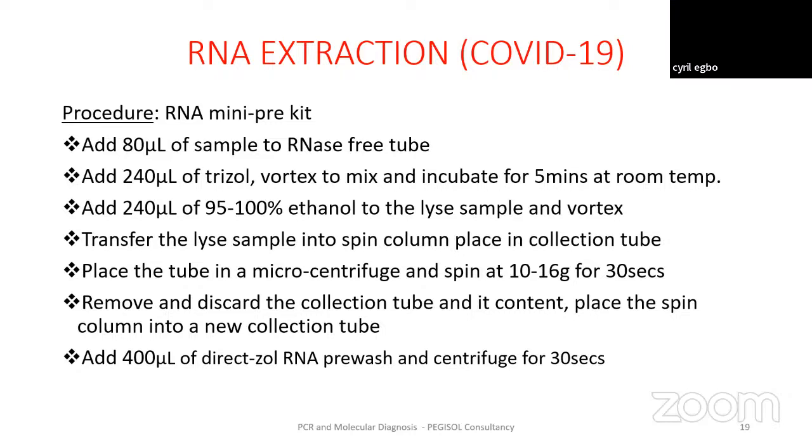Most times that is used for paternity testing. So you use a buccal swab to do paternity testing by using that swab stick to scrape the cheek. That one is still the same process as COVID-19.